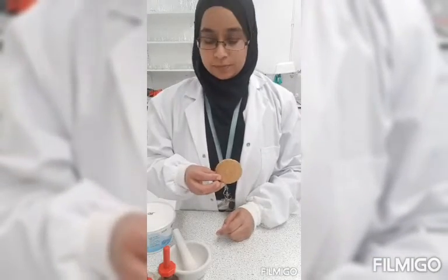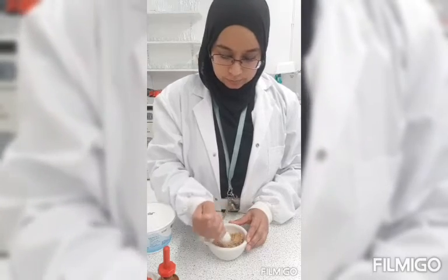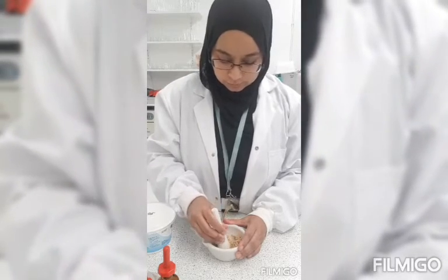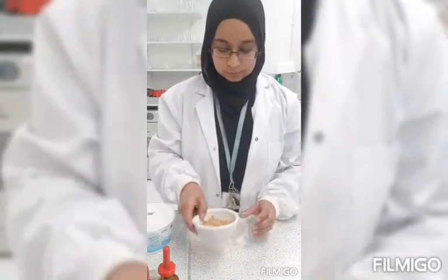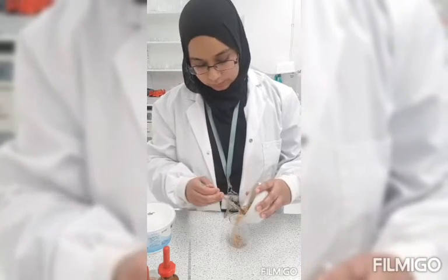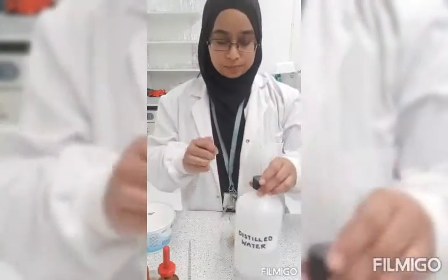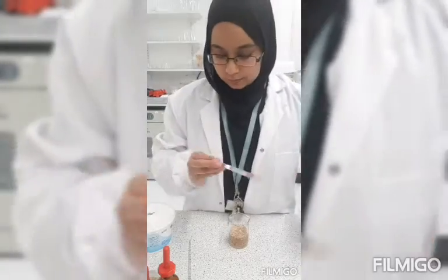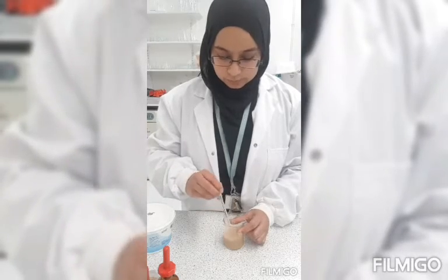For any solid food, such as a biscuit, what you will need to do is grind it in a pestle and mortar. Put it in a beaker, add some distilled water, and give it a good mix with the stirring rod. Then we're going to filter that through the filter paper and funnel into the conical flask.